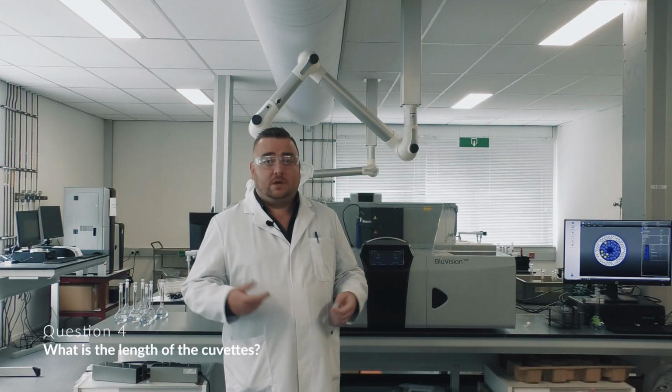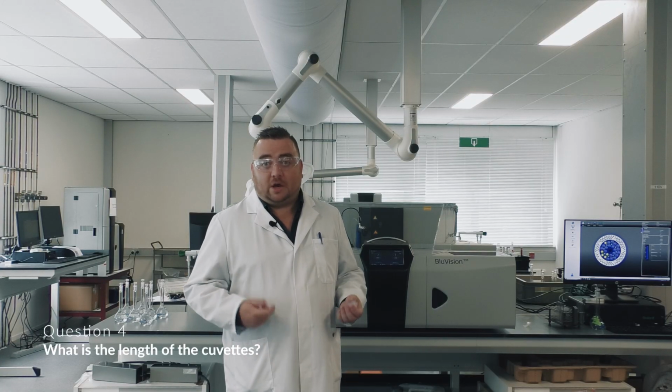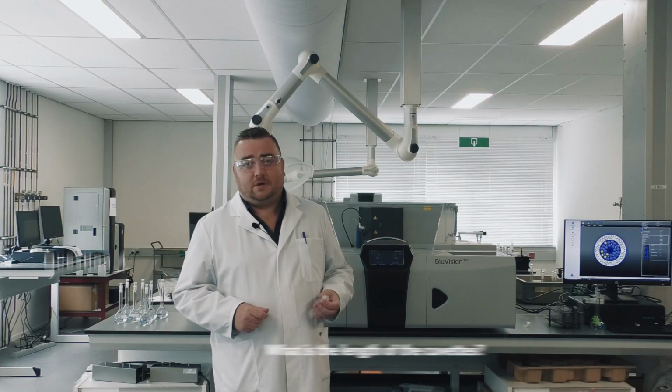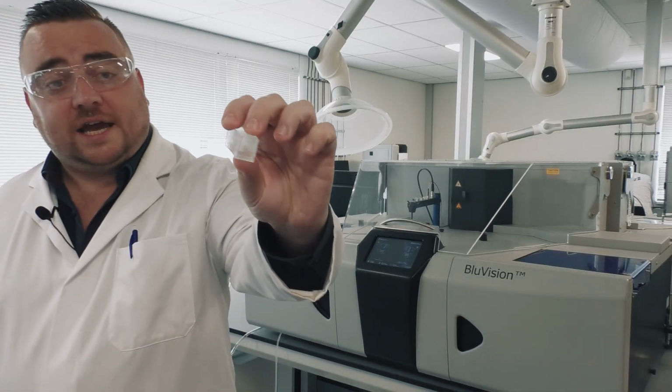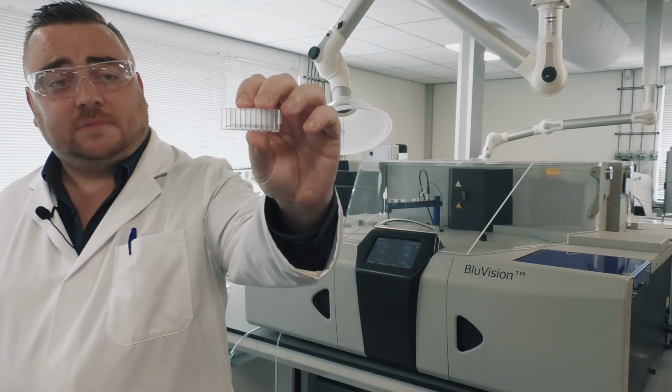So that brings us to question 4. What is the length of the cuvettes we use? So when we say length, we're talking about the optical path length of the cuvettes. And actually, as you can see here, we use a 15 millimeter cuvette.